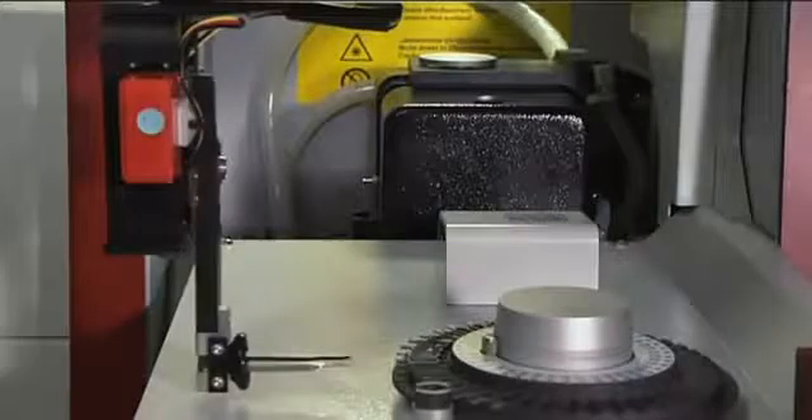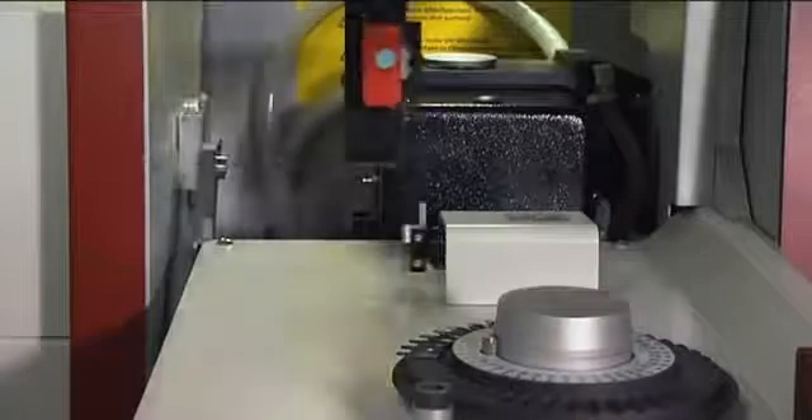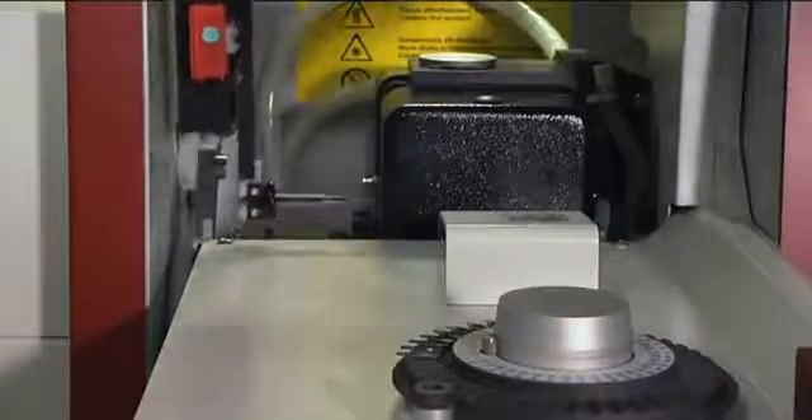The robot arm of the solid sampler transports the platform to the integrated micro balance. Subsequently the sample is transported into the graphite furnace. After the measurement the platform is immediately ready for the next sample. The double turntable enables up to 84 samples to be measured completely automatically. The samples can be metered and weighed over the function keys at the front of the instrument, and sample amounts of 50 micrograms and less are adequate.